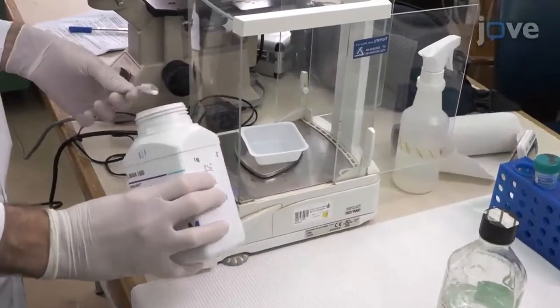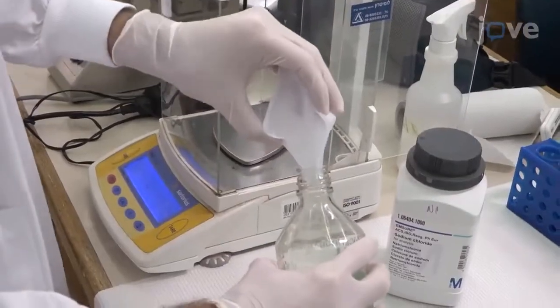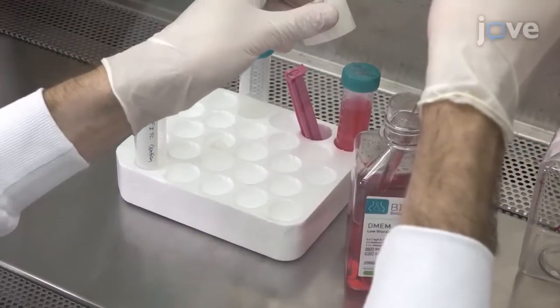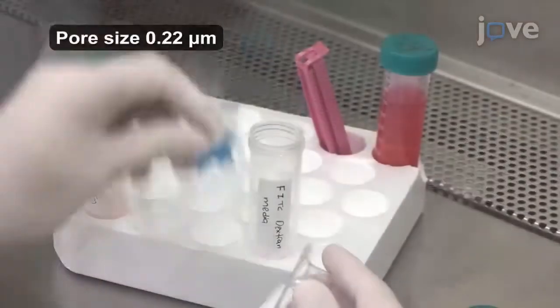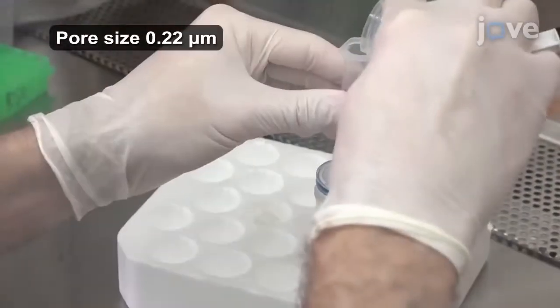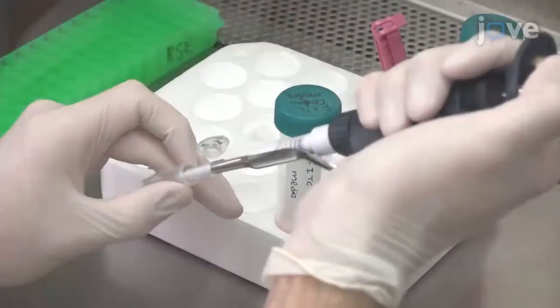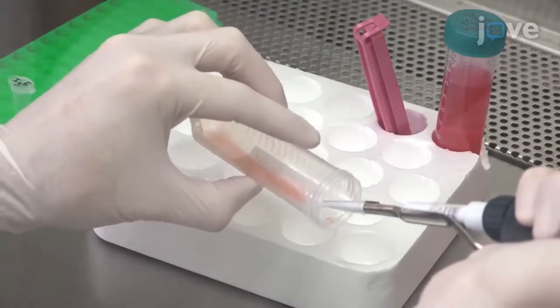To begin, prepare a stock solution of 20X Tyrode's buffer according to the TEX protocol. Next, mix 3mg of FITC-dextran powder with 3mL of culture media. Filter the dissolved FITC-dextran with a cellulose acetate syringe filter unit. Then add mouse IgE to a concentration of 1mcg per milliliter.